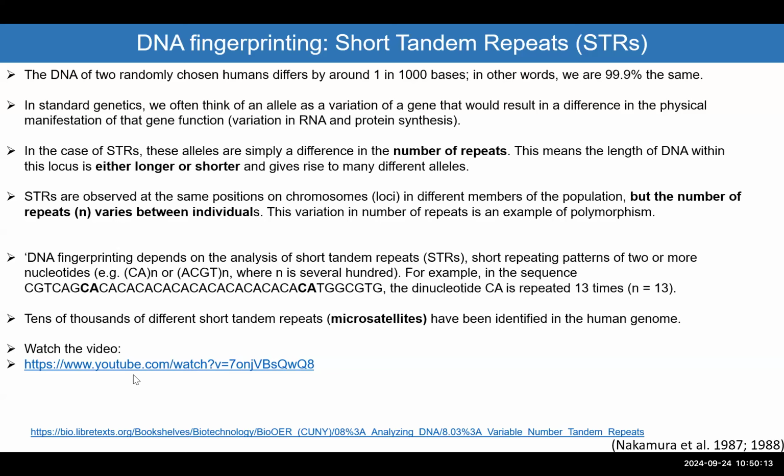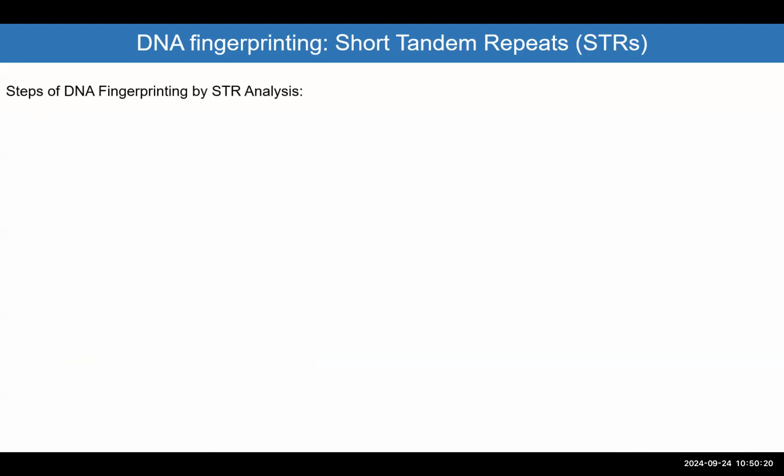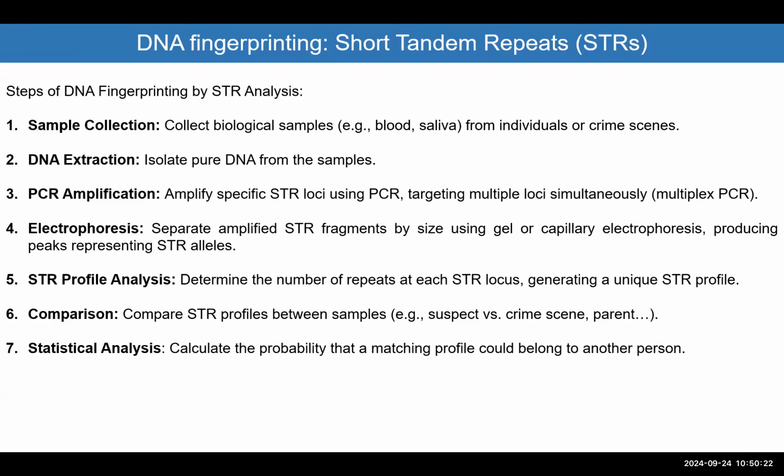And to give you an idea how we can use that in forensic studies, I'll come back to this video, but I will describe the steps again here for you. So first, you have to collect the sample. Let's say we have a crime scene or whatever.